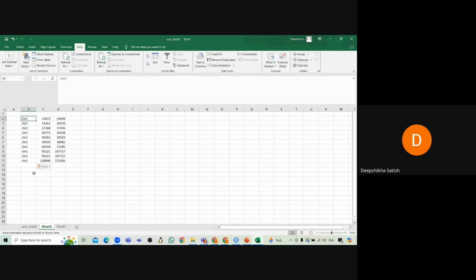This is the chromosome location. This is the start coordinate. This is the end coordinate. So this format, we call it the BED format. I've told you that I will tell you this BED format later. BED format, browser extensible data format. This is nothing but just a chromosome location, start coordinate and end coordinate. Okay? Is it clear?